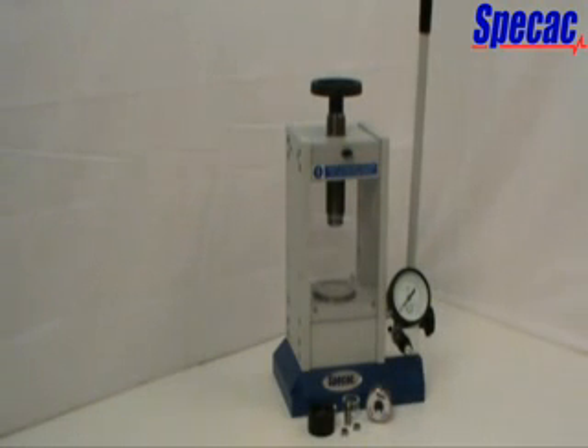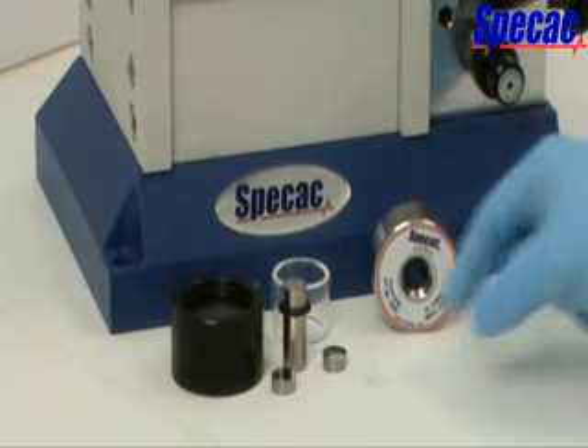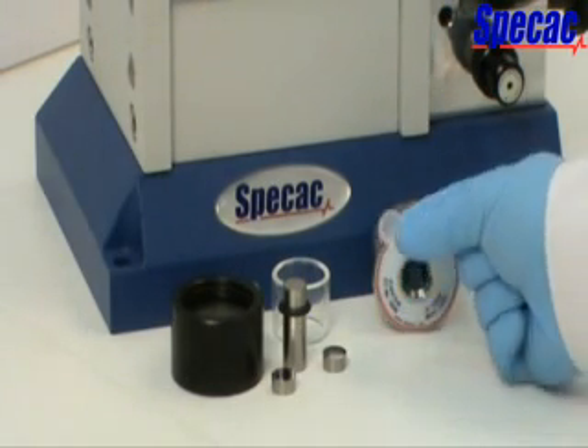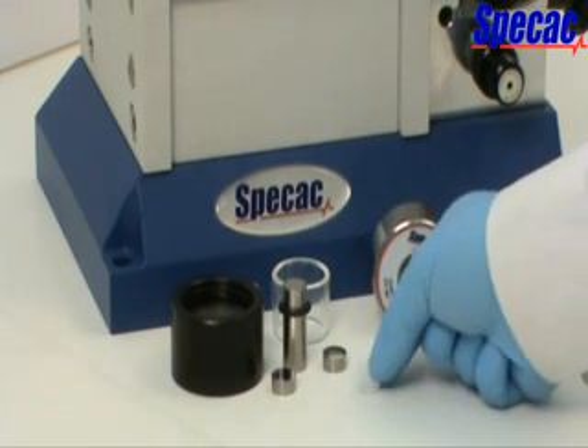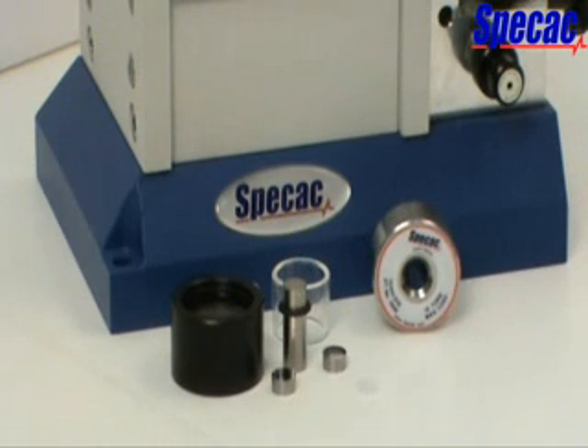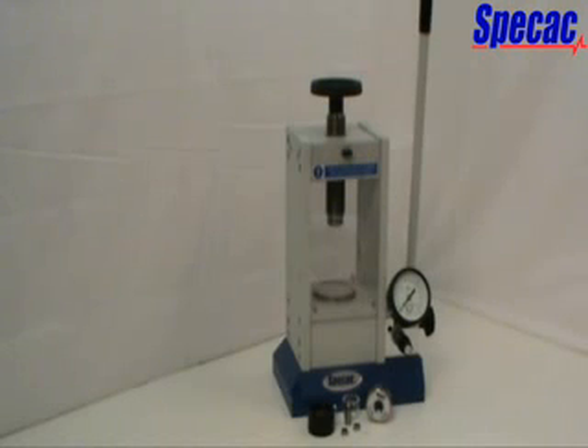The SPECAC ATLAS manual 15-ton hydraulic press, part number GS15011, has been designed for a wide variety of pressing applications, but is specifically suited to the preparation of 13mm diameter KBR pellet discs with solid sample using the SPECAC 13mm evacuable pellet die assembly. Such KBR solid sample pellets can then be analysed for obtaining an IR transmission spectrum for sample species used within industries such as pharmaceuticals, petrochemicals, biotechnology, environmental, material and forensic sciences.